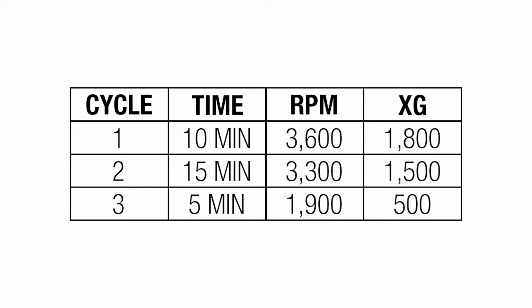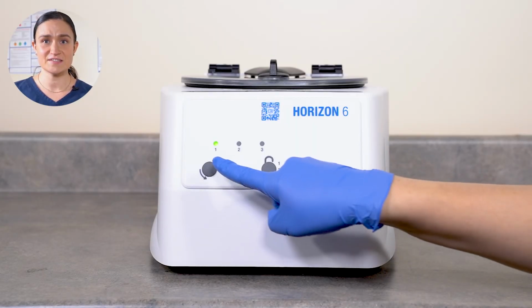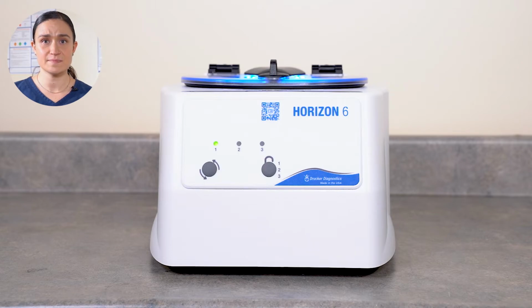Keep in mind, those can be customized to your lab's preferred spins if desired, but this is what will be programmed into the Horizon 6 when it arrives from the Drucker Diagnostics factory. With your desired cycle selected, press the Start button. The centrifuge will automatically lock and the rotor will begin to spin, accelerating until it reaches the cycle's RPM. It will run for the cycle's programmed time.